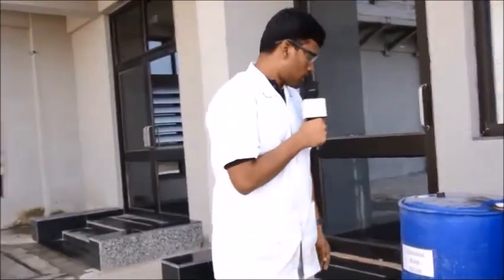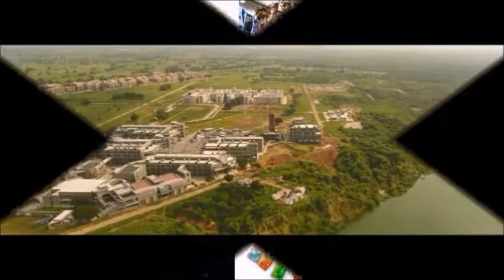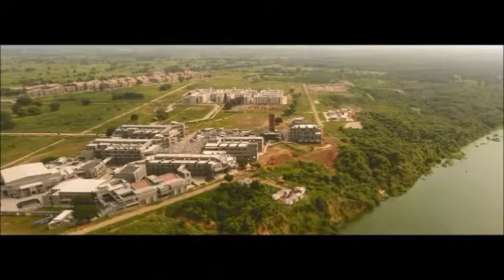Coming to how we are going to dispose of all the drums, for all the drums we have a contract with BEIL, the Bharuch Enviro Infrastructure Limited. They will come and collect all the solvent drums and maintain the proper disposal of the solvents by the incineration process. Digital waste such as compact discs and pen drives is recycled or taken away by waste managers of the Tri-Bin initiative on the campus.